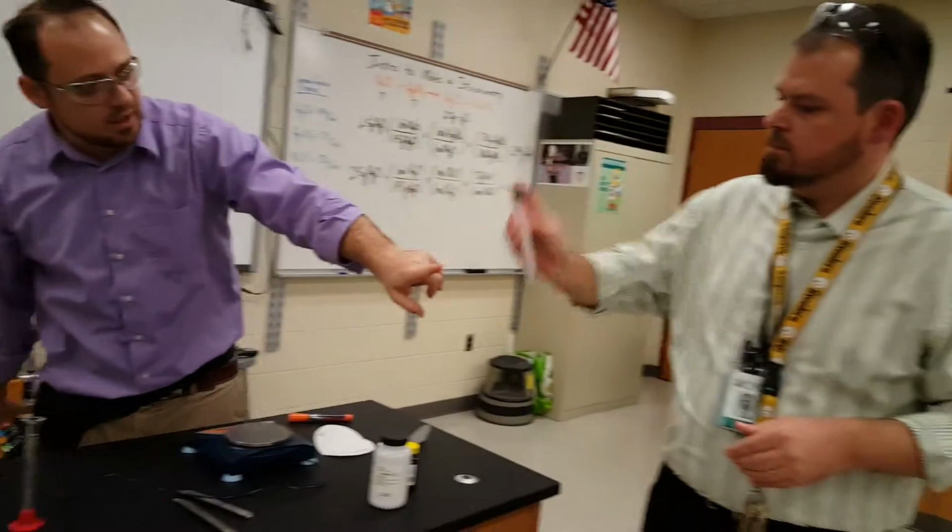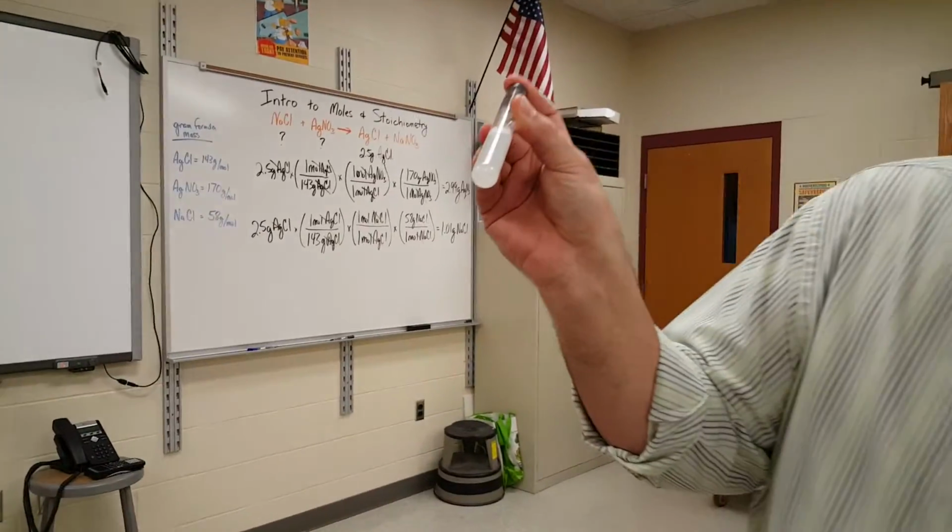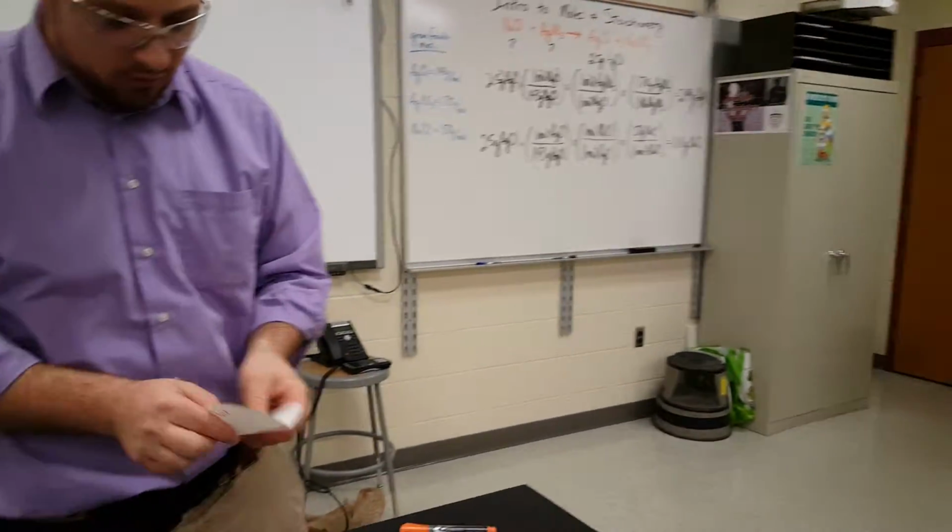Notice that it's gotten a little bit cloudy, probably because there's some sodium chloride in our water supply first reacting in the first place. You can even start to hear the crystals react a little bit to make that stuff that we're looking for.